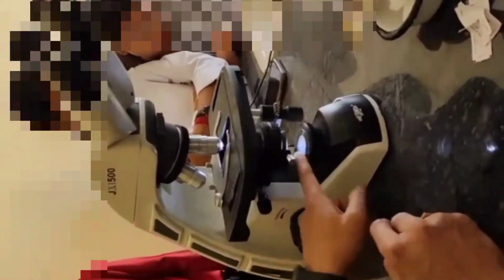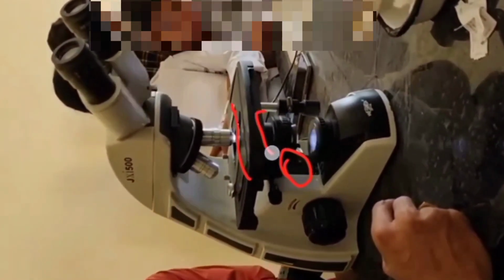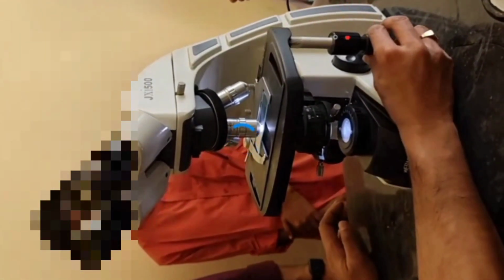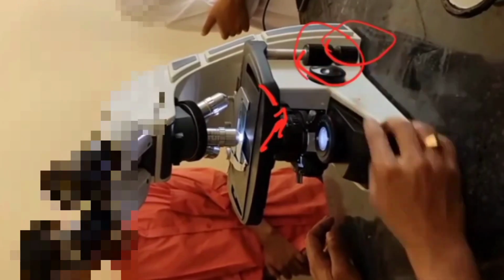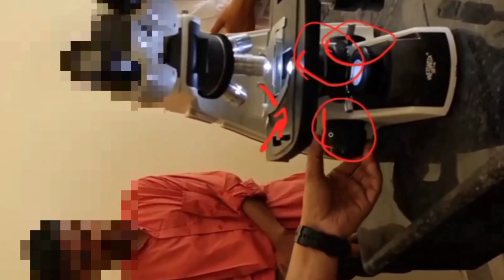And this is the rack to move the slide forward, backward and side by side. So both directions we can move the slide. And this is the fine and coarse adjustment.